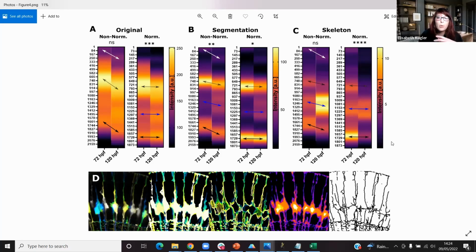And one thing, for example, here is also that obviously it's important that you compare your values against each other, because if you just look at one plot, I always find it hard to interpret what that means. And so when you just look at 3 versus 5 days, you can already say, okay, there are actually differences happening. And this is when biology makes sense, when you compare 2 states against each other. And so this is just one example of when we would use non-normalized versus normalized. But again, I would run both of them and then see what makes sense for your data.